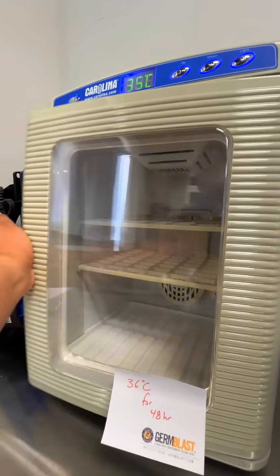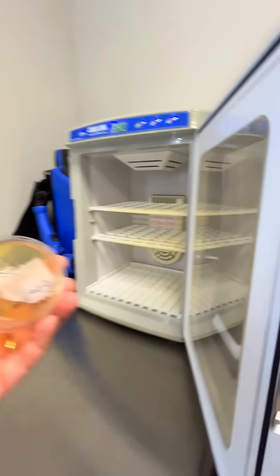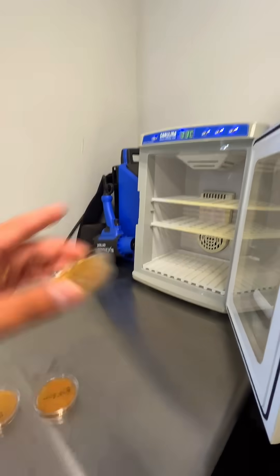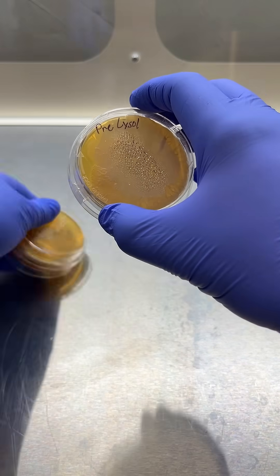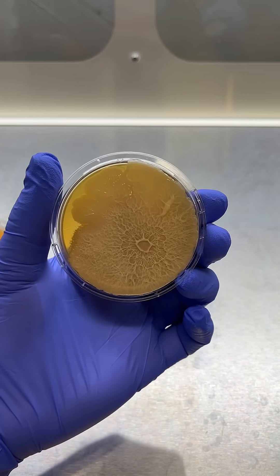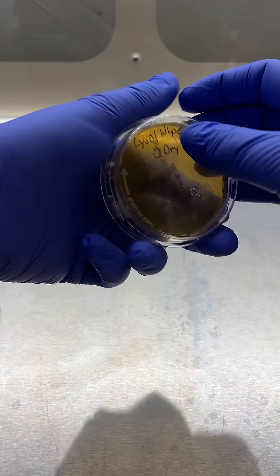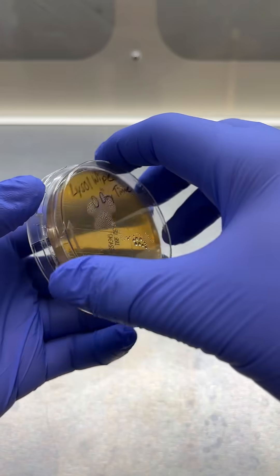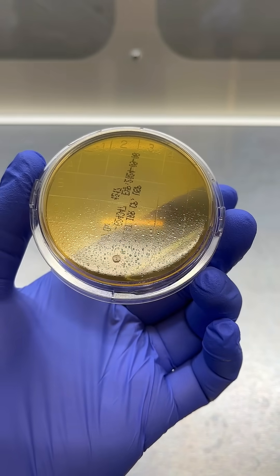Time's up, let's see what our samples reveal. First, we're going to look at the before plate — bacteria everywhere. Next, we look at the immediately after plate: fewer bacteria, but still some small colonies.